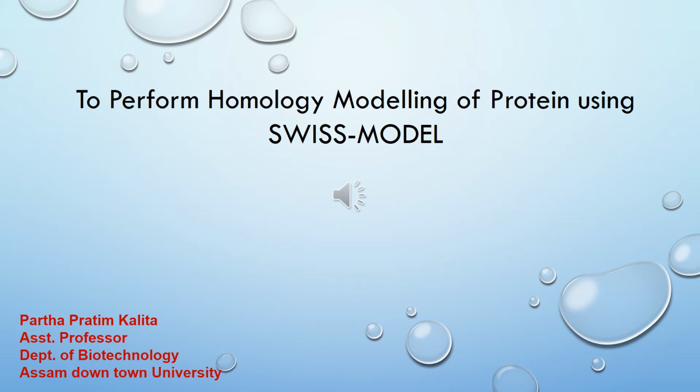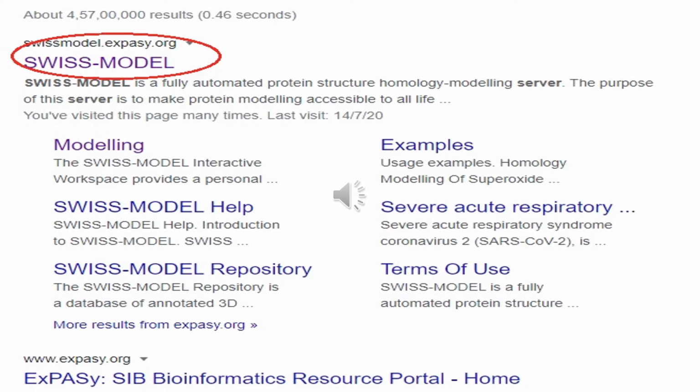Hello students, in today's practical we'll perform another homology modeling of protein using the Swiss model server. Earlier we used the Zeno 3D server for constructing the 3D structure of a protein sequence. So in this practical we'll use the Swiss model server. For this we first have to go to the Swiss model homepage.